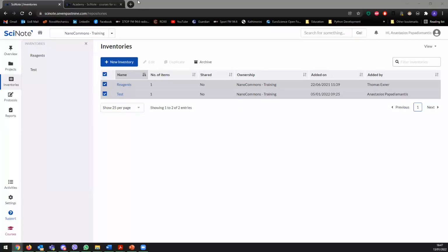As long as there is not much traffic, it doesn't make sense to have a big machine behind that, but it's cloud-based, so we can easily increase the number of processors, hard drive, main memory, everything, because we just have to ask the cloud provider to increase that.